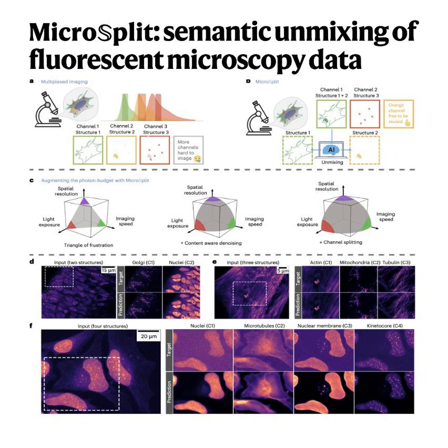Right. What about the third one, structural similarity? This one is critical for experimental design. If you superimpose 2 identical-looking structures, for example, 2 different but visually identical microtubule networks, MicroSplit cannot separate them. Why does it go blind there? Because it relies entirely on structural priors. The AI hasn't learned to untangle overlapping string, it's learned to tell a string apart from a ball. Okay. So if you give it 2 overlapping shapes that share the exact same geometry, the math cannot find a differentiating morphological variable to grab onto. It needs distinct spatial patterns. Which ties perfectly into the fourth limitation, lack of spatial correlations.